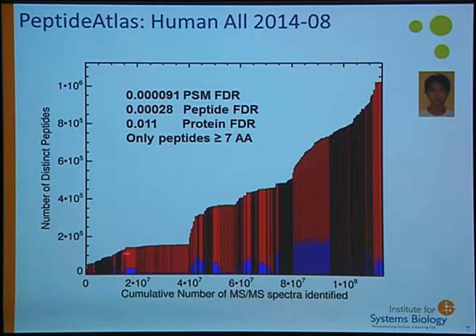But you can see here that we have these technology jumps. In each one of these experiments, you might see there's a relatively small number of identifications being done here. And this is in the early 90s, 2000, that we're getting into these big technology jumps when we go from, say, normal ion traps to these quadrupole type ion traps. And that's when you got these technology jumps. So you get a lot more peptides being identified and a lot more new peptides being identified which haven't been seen there before. And so we can keep on building on what we've got.